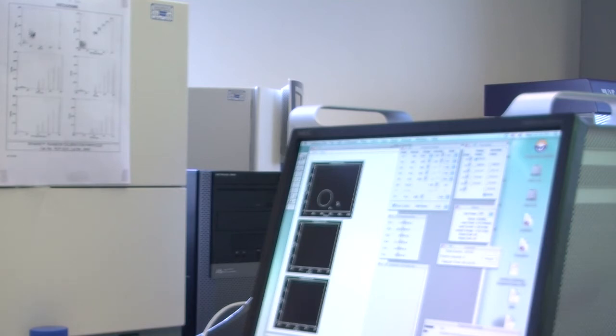It might be worth putting in one of these at that point. Yes, we can do it. So what I'll do is give you 3 of these each. You'll need to label them, your 3 tubes.